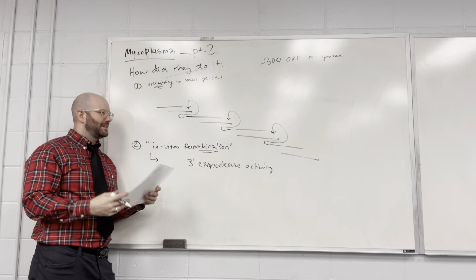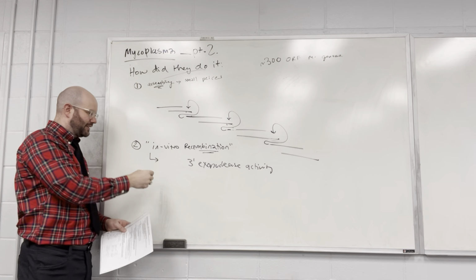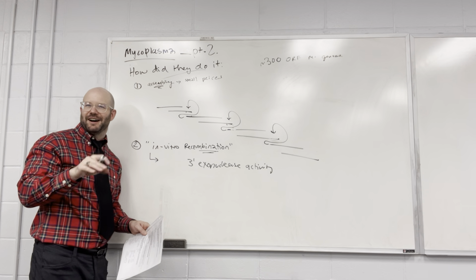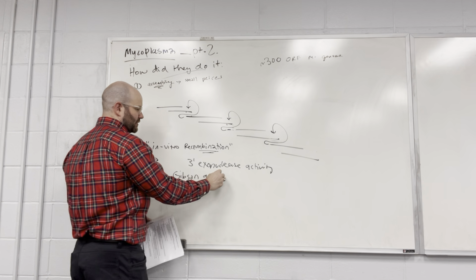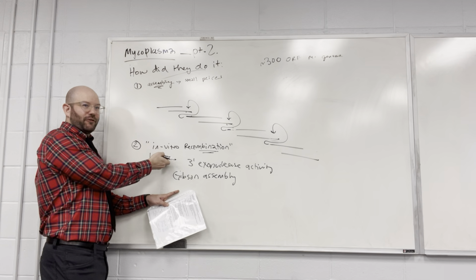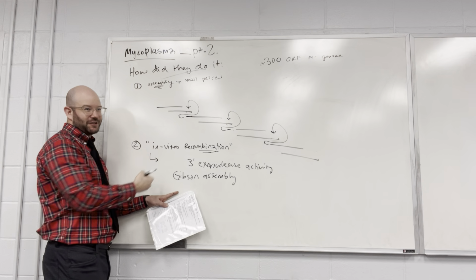It's the Gibson pattern. That's how Gibson assembly works. Is Gibson assembly drawing a blank for everybody, or is it an aha, I remember that? I was thinking, because we were using small pieces, I didn't know if it was still considered Gibson cloning. This is written by the guy who invented Gibson assembly, and this is probably in the process of him inventing that approach. That's why this is cool.